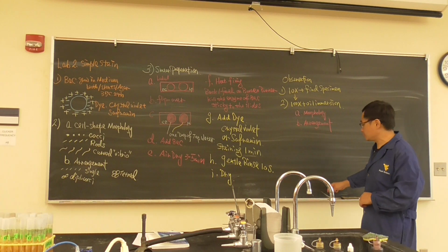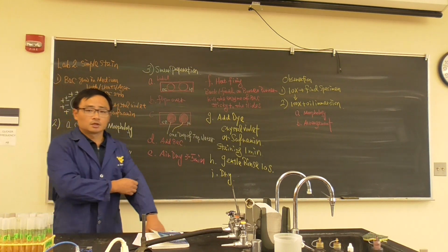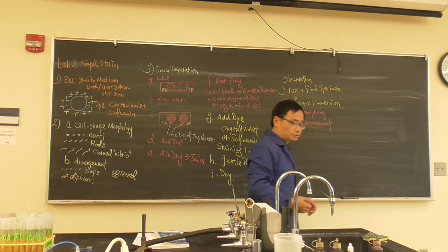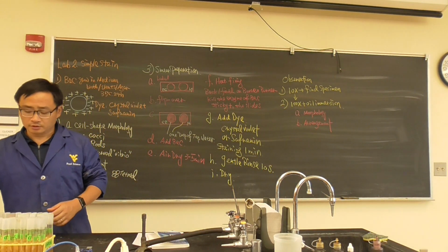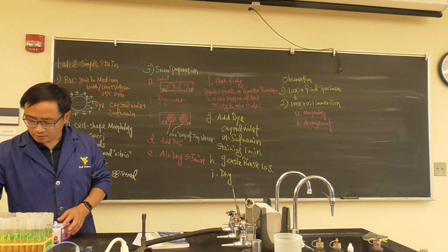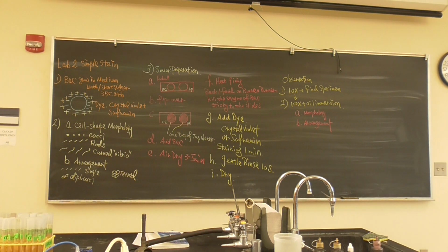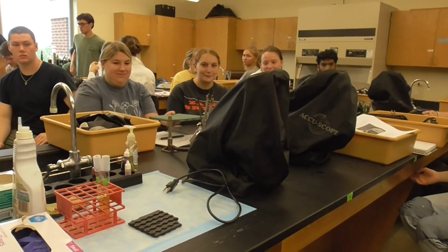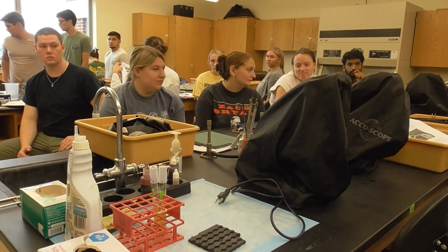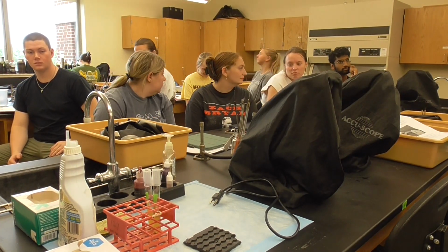Okay, so today is pretty much the simple steps to make a bacterial smear. Now I'm going to show you how to make a slide. So I want everybody to go to the front desk. I'll be right here. I'm going to show you how to do the simple stain, so it'll be just right here. Okay. So the glass slides, we'll be using gloves.